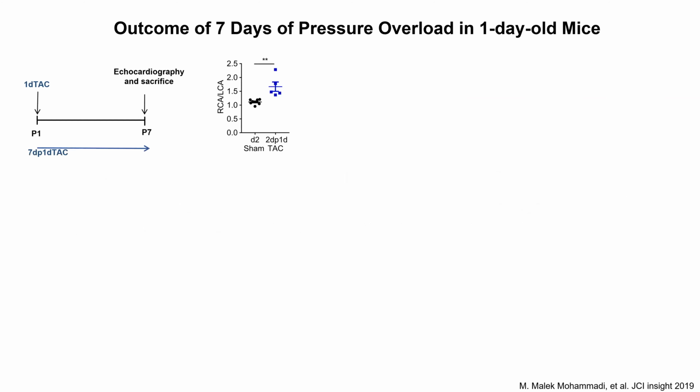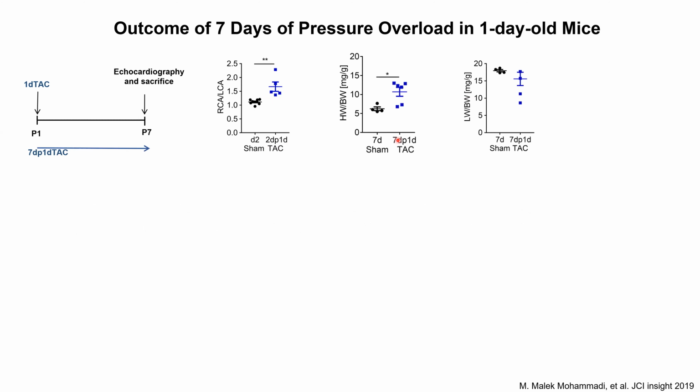So what is the outcome of the surgery? I performed the surgery from the first day until 7 days, so induced for 7 days. And as you can see, I have successfully induced pressure overload, which was measured 2 days after surgery. And 7 days after surgery, the hearts were heavier than sham hearts, but there was no difference in the lung weight to body weight ratio.